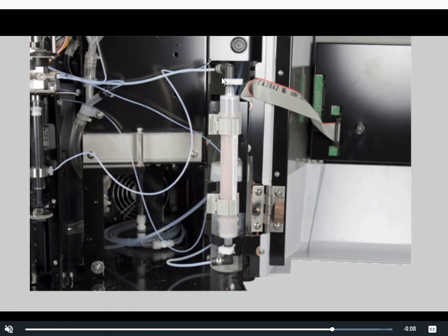Those little metal clamps, they are going to be stubborn and they're going to hurt sometimes. You are going to have to squeeze those in to loosen that tubing up. And depending on how old those metal clamps are, they might do their job really, really well. And it's going to be very difficult for you to get the tubing out of that clamp, but it is meant to do that. You do not want any leaks around those areas. So that's all there is with exchanging a halogen scrubber.